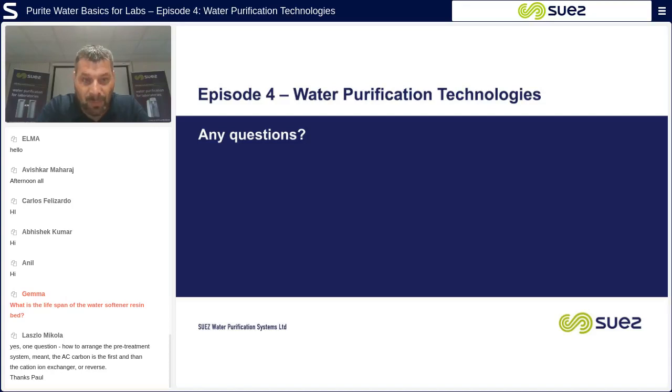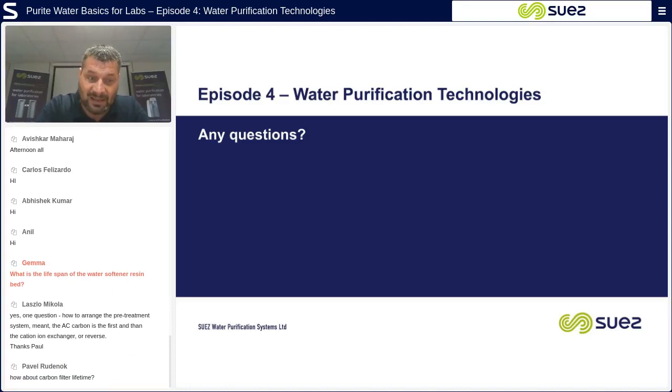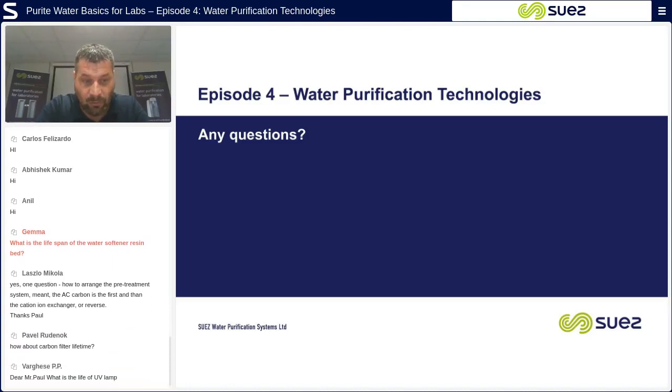I can understand what you're probably thinking, that if we put the AC before the water softener, we're protecting the water softener. But obviously, we're opening up then that we've taken the chlorine out, and we may be breeding some form of bacteria in the water softener. So we like to keep our carbon after the water softener and directly before the reverse osmosis unit.